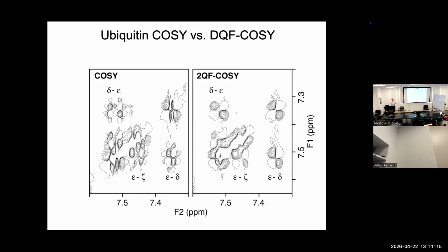In the beginning, when the pulse sequences were being established, of course, if we did a COSY and then connected an amide hydrogen to an alpha hydrogen, the problem would be how do we connect the alpha hydrogen to the beta hydrogens? And there was developed then what was called a relay COSY, in which you would have a second transfer period in order to relay the magnetization another step along the way.